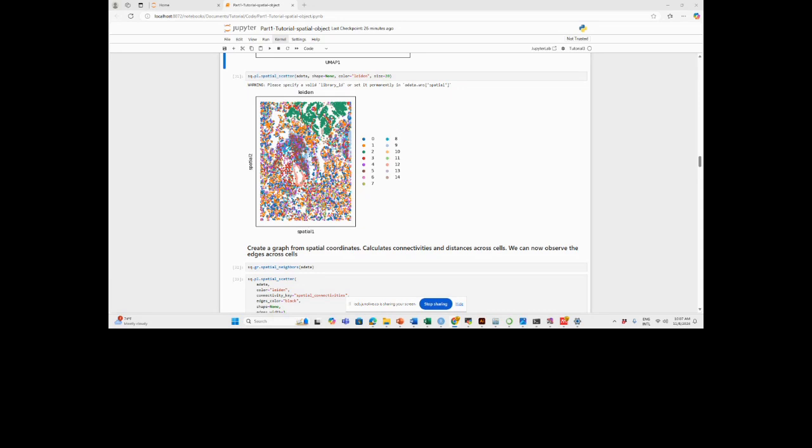Any requirements for the staining? That is a question that is more for the wet lab. What I know is that there are no specific requirements. In this case, they use staining for marking the nucleus and the border. The specifics, I will have to check. However, all this information about the staining is on the website. There are several white papers. They're not journal papers, just information about what they use. All the specifics for the wet lab experiments are there.